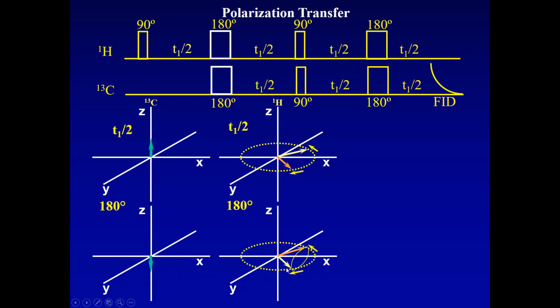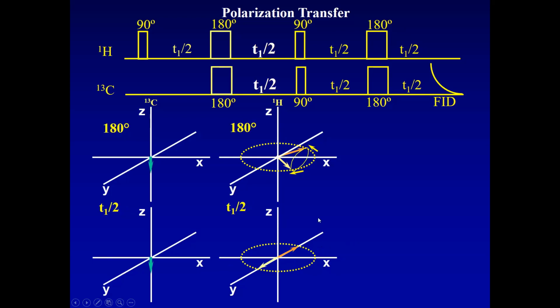And here we have moved these so they flip them. And then by flipping this, we've actually continued to make the vectors drive in the same direction. They're still driving apart. So we flipped this. By flipping this, we've caused the net magnetization to continue to separate here. Our goal actually is to wait during this next time delay for them to go completely opposite.